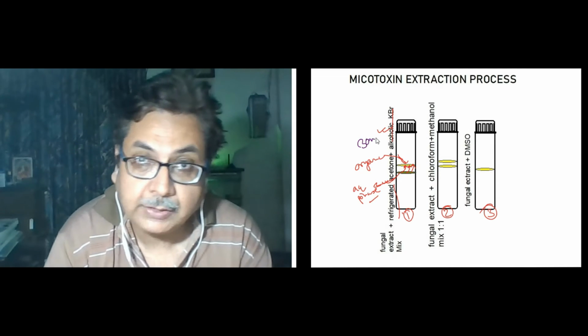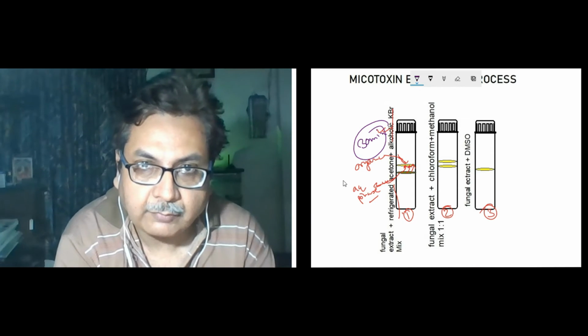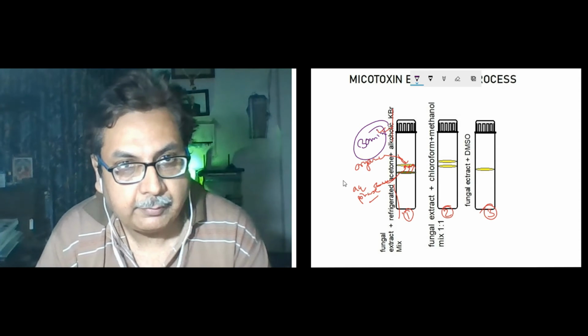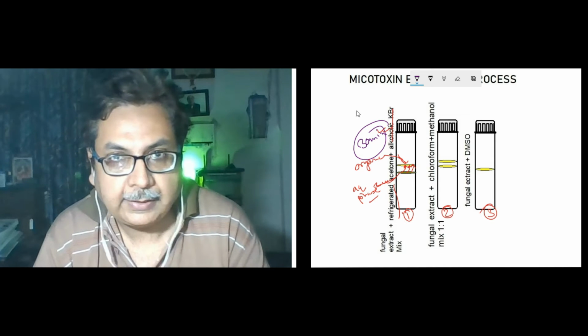around 30 minutes. So you should be very careful with this time. This 30 minutes is a very important time. More than 30 minutes you can keep, but not less than 30 minutes. Keep this in mind.